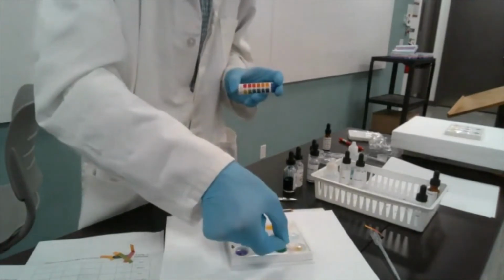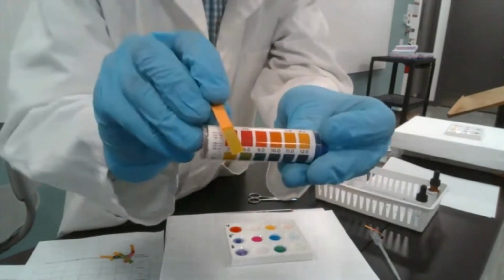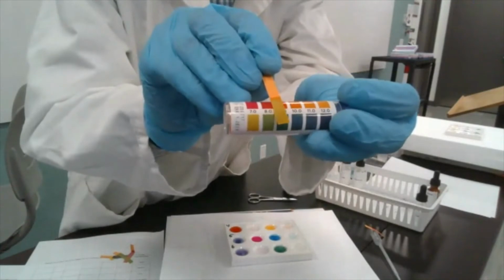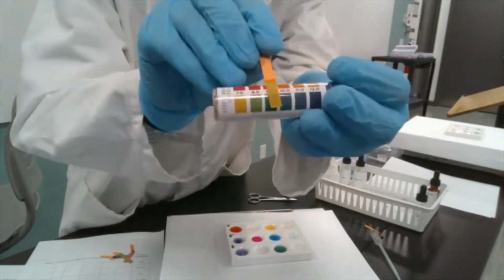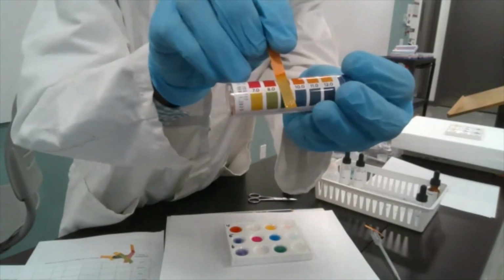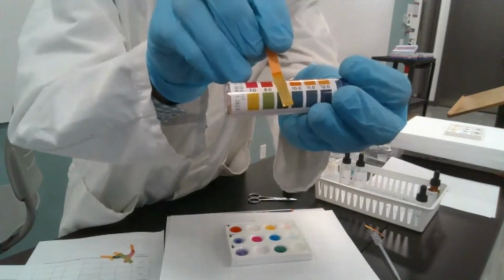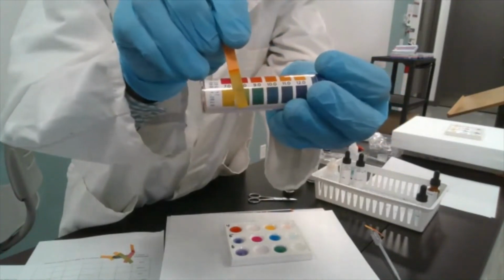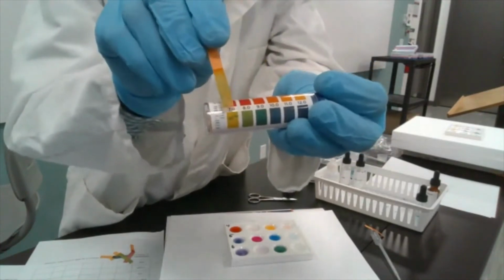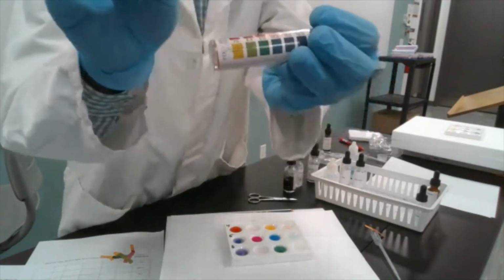Finally, let's dip our universal paper and compare. So to me, what does it look like to you? 6, 7? 7, exactly. You see that we're almost exactly at 7. Again, this thing isn't perfect either, but it's much better sometimes than some of those other indicators.